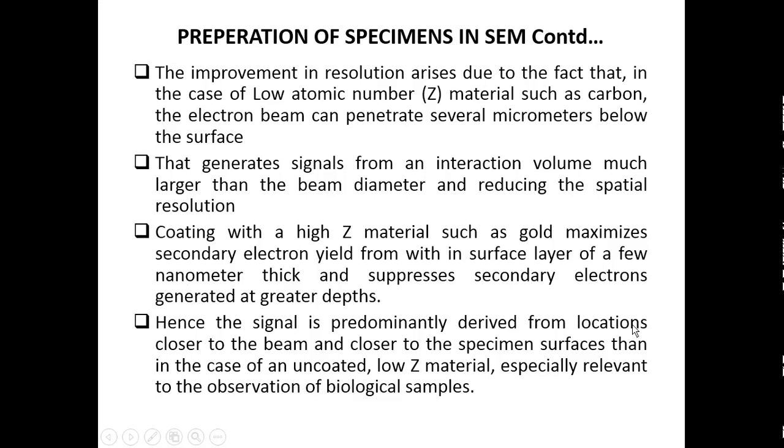The signal is derived from locations closer to the beam and closer to the specimen surface than in the case of an uncoated low atomic number material, especially when the surface under test is a biological sample.